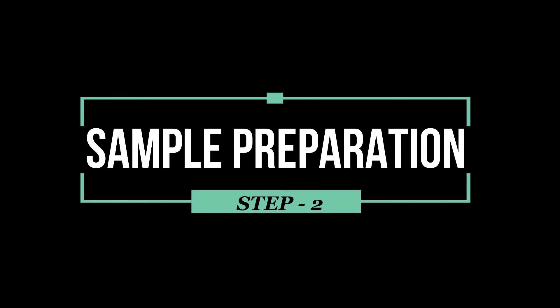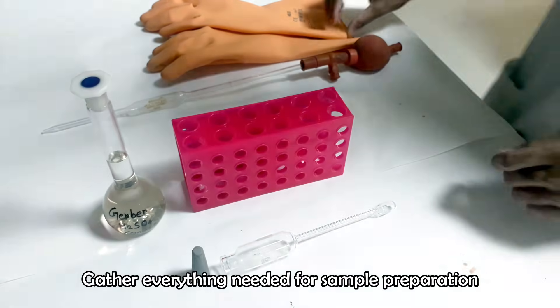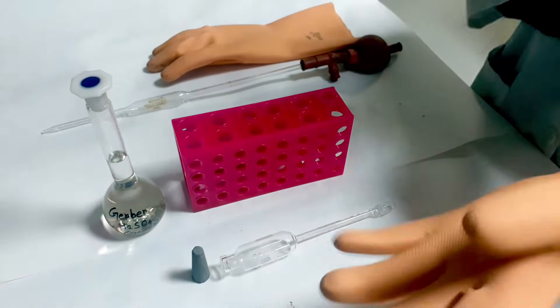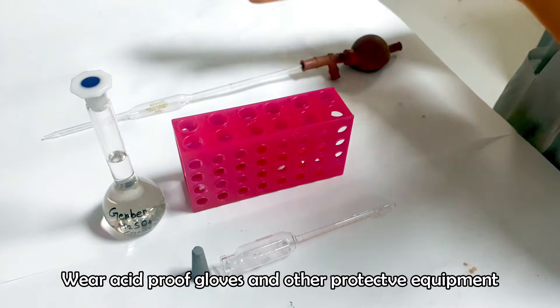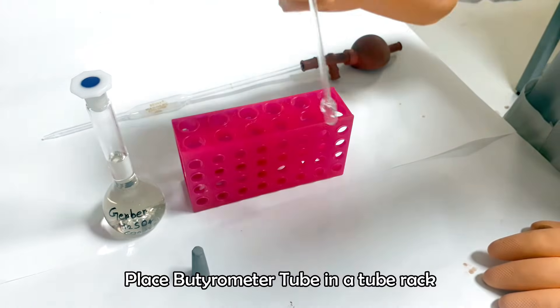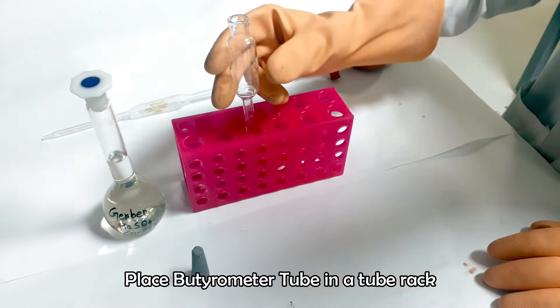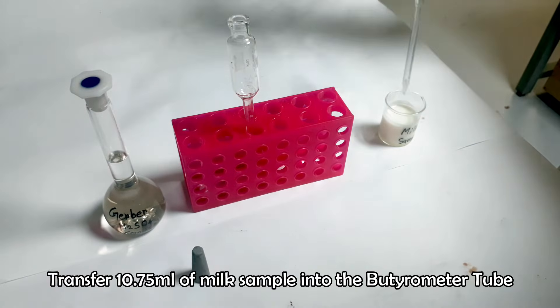Now we are ready for sample preparation. Wear acid-proof gloves and other protective equipment. Keep the butyrameter tube in a tube holder. Put 10.75 ml of milk sample into the tube.